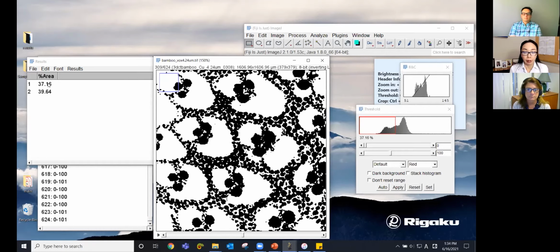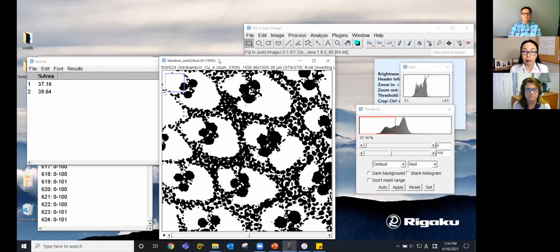To get the entire volume percentage, we need to count the total voxels. And that's where the plugin we mentioned at the beginning, the Voxel Counter, comes in handy. So to use the Voxel Counter, I already installed it, so I can just go to plugin and use it. But just in case you've never done this before, let's ask the audience the third question, Angela.